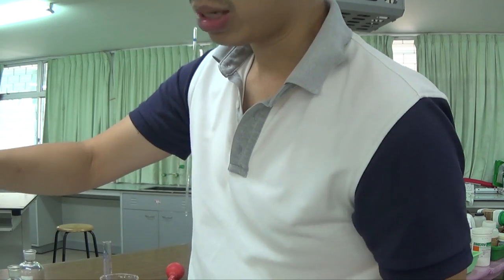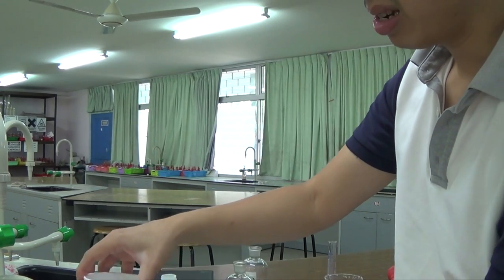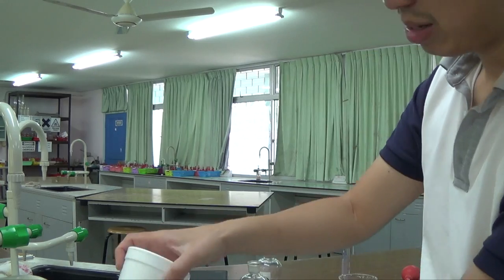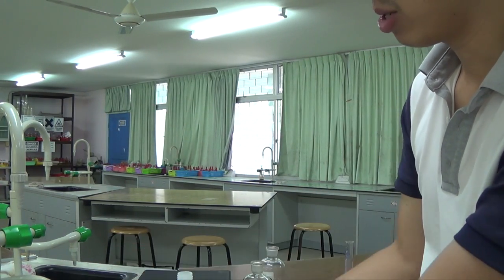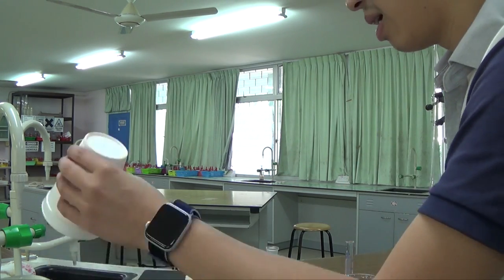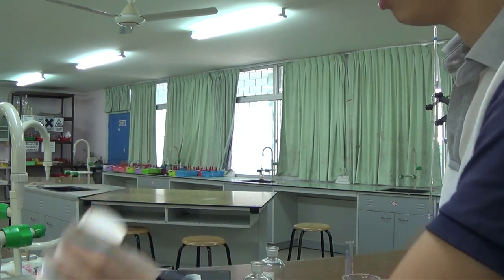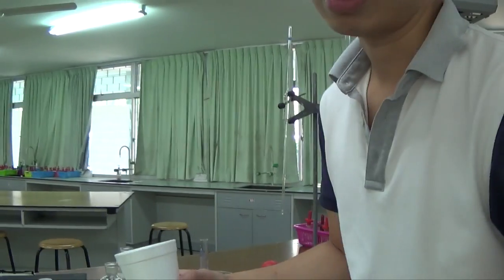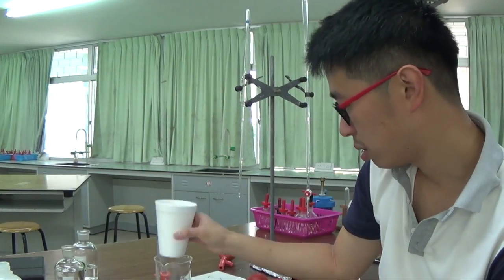So I've just rinsed it with distilled water. I throw away the whole thing, I rinse the polystyrene cup with a bit of distilled water. I don't want tap water because if I make up my stock solution with distilled water, what is the point of washing with tap water? I know it costs a bit of money to make distilled water because you need energy to get it, but it's essential. That's why practicals are expensive to begin with. Okay, so now I have my clean cup again. It's just got distilled water in there.